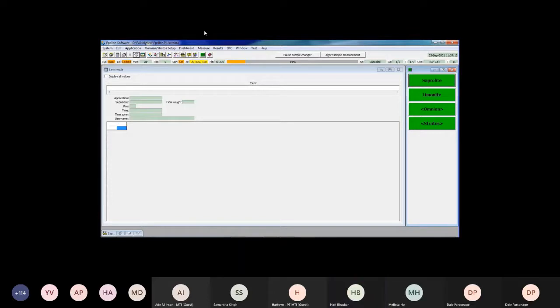This application was set up and optimised to run for 3 minutes, and that covers the light elements of magnesium, aluminium, silicon, as well as the targets of iron, nickel and cobalt, and the additional calcium and chrome trace elements. So it's quite a fast analysis, and it can deliver some very accurate results in a short period of time. I've got that measurement running in the background. I'll just set up and get my presentation ready.